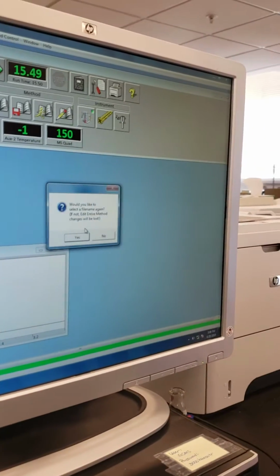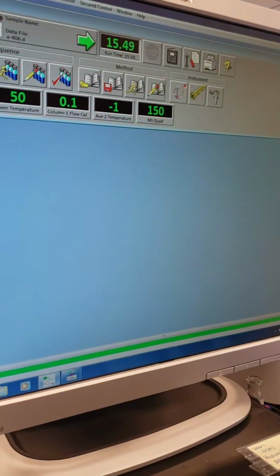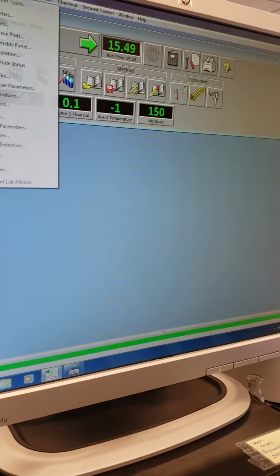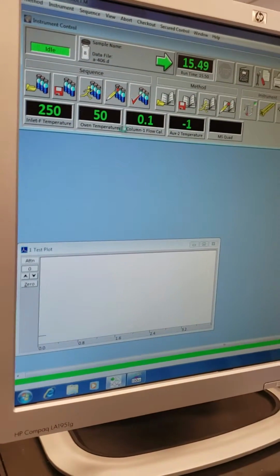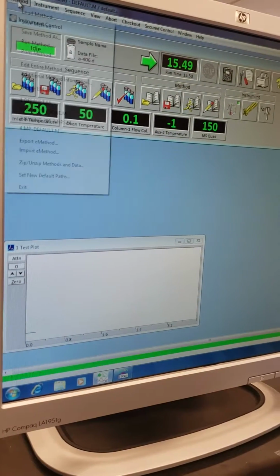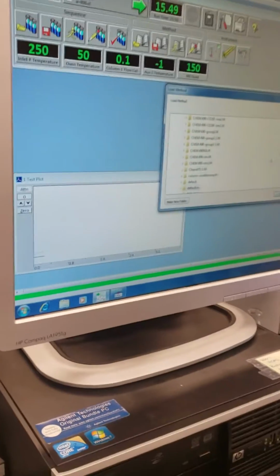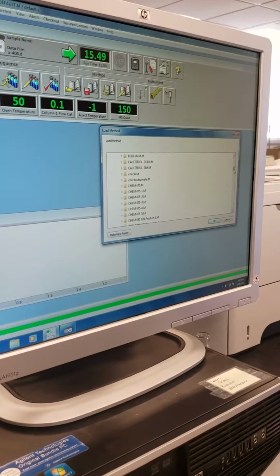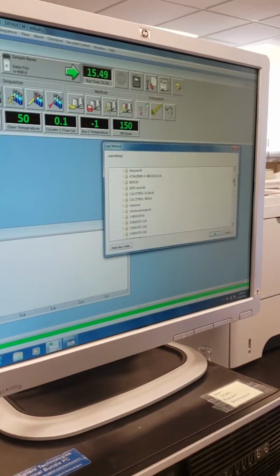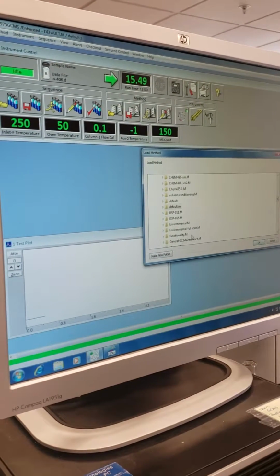I'm just going to cancel this. Okay, I noticed with some people they created their own folders to put it in, and you're welcome to do that if you want. Yeah, probably we'll create one, so we can do it now if you don't mind. No, not at all.